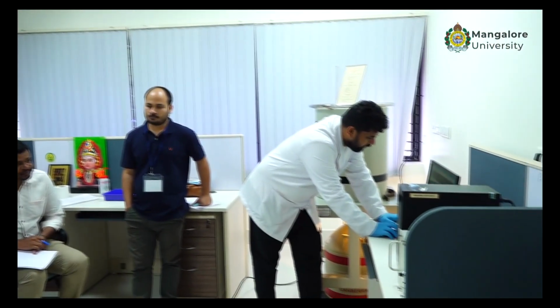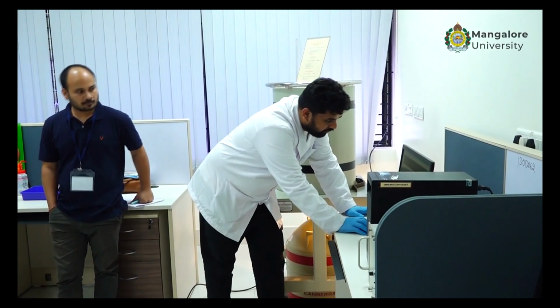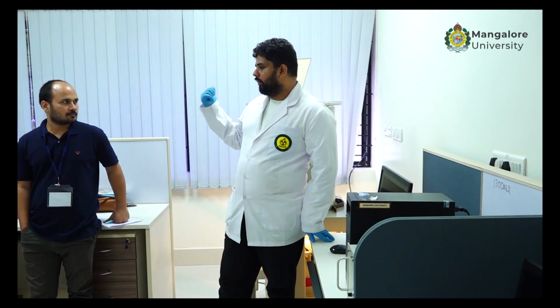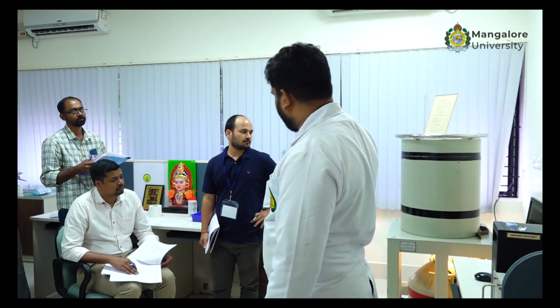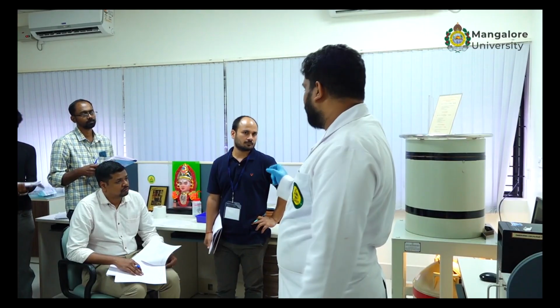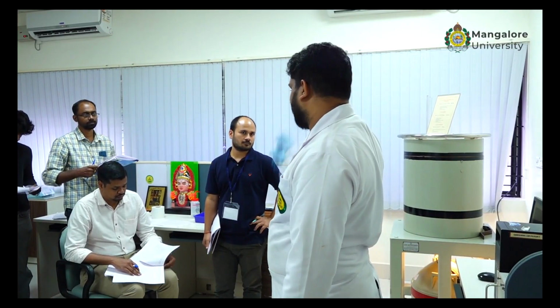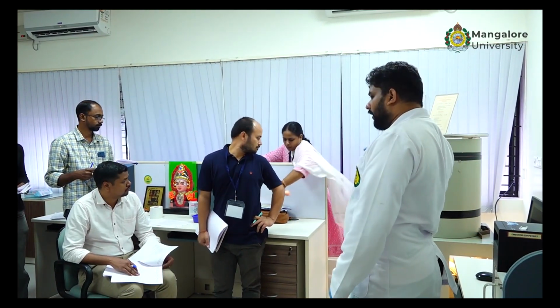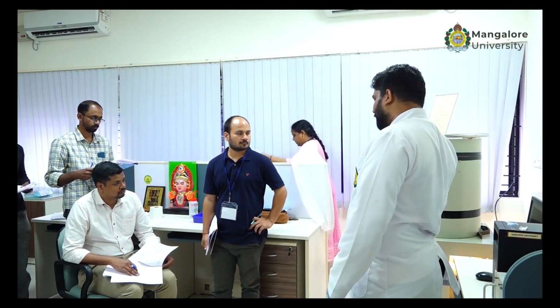Okay, first I will give you the QC of the water sample. Do you want to analyze water, or what are the samples that you have identified? Then I will give you the activity values for these radionuclides, and then you can continue in calculation of the area under the spectrum.